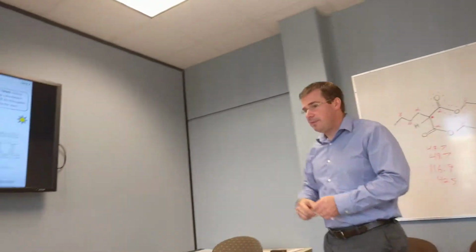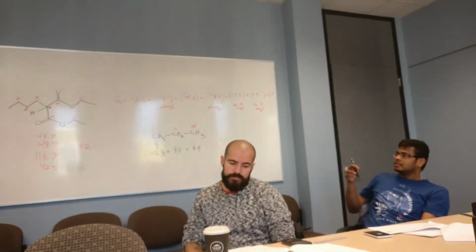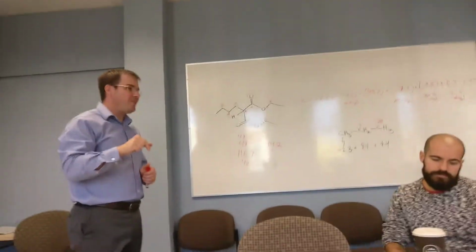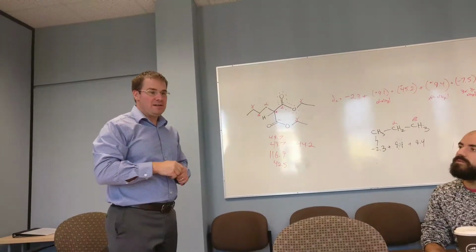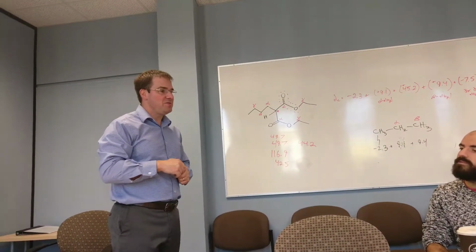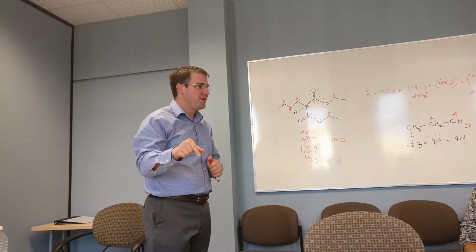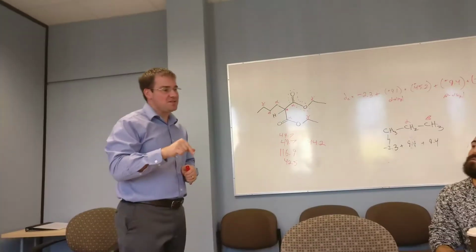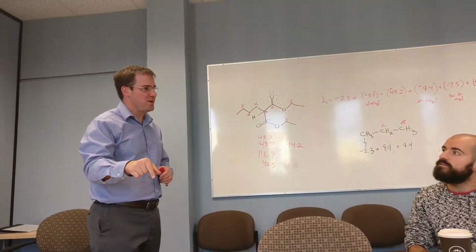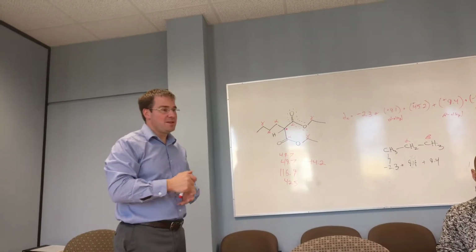Is that new ChemDraw has the prediction? All the versions of ChemDraw every year since the mid 2000s, if you buy the Ultra version of ChemDraw, have the NMR prediction built into it. Ultra means the one we don't get. Yeah, our site license is for the STD version of ChemDraw, which does not include the NMR calculation. Okay. So that's the difference.